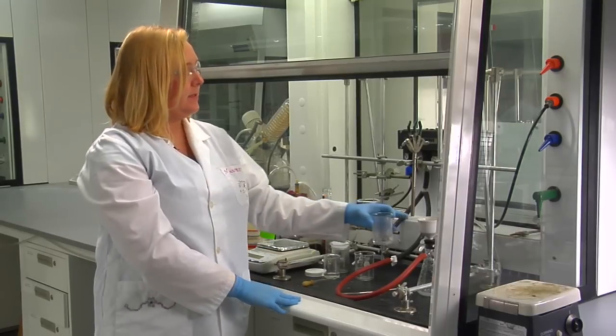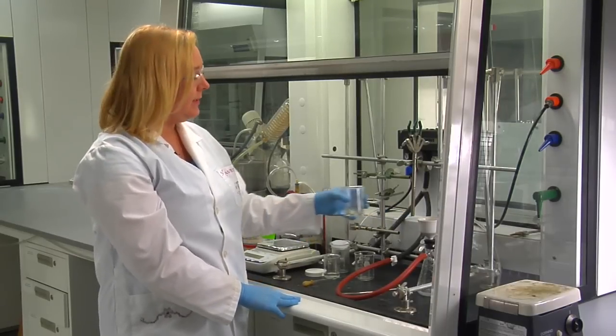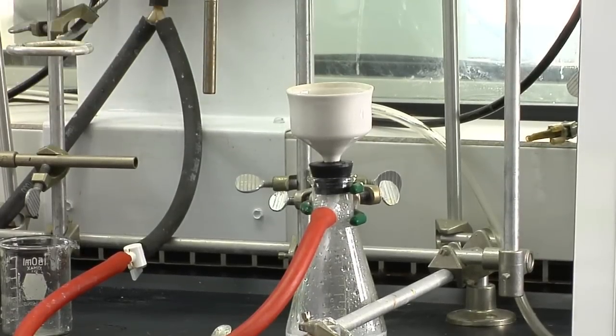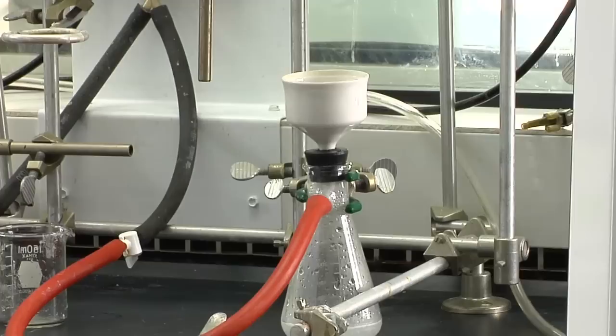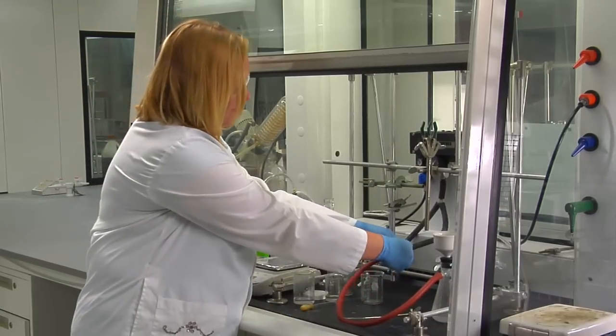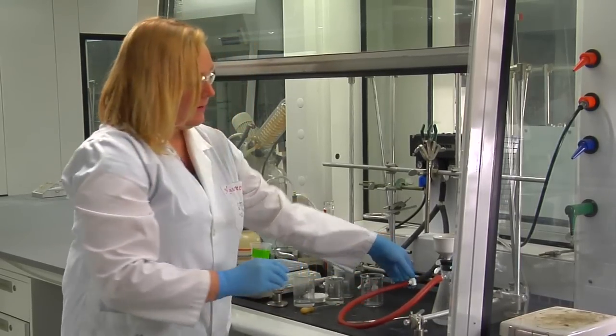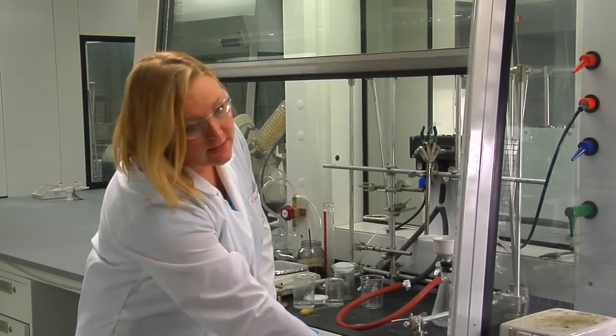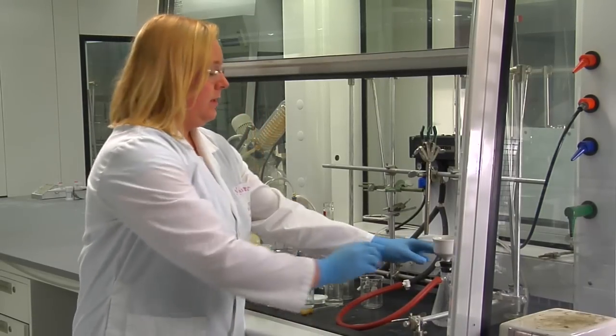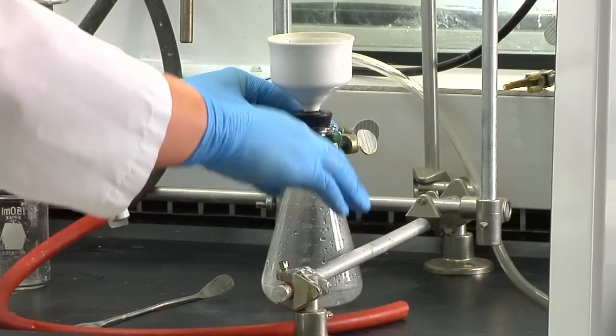Finally, you can rinse your salicylic acid with some cold water. Once it is dried, you can then turn off the vacuum and turn off this knob. Remove the hosing.